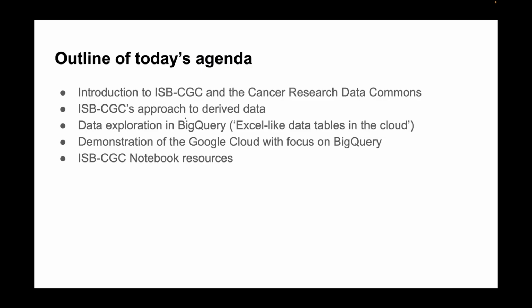The next part, I'll be going hands-on in the Google Cloud console and demonstrating how to perform data exploration in BigQuery. BigQuery is a pretty neat tool. I like to compare it to an Excel in the cloud kind of functionality. It's a little bit more functional and more complex than that, but if you're at all familiar or comfortable with performing macros or function calls in Excel, it's really not that difficult to transition to doing the same in SQL.